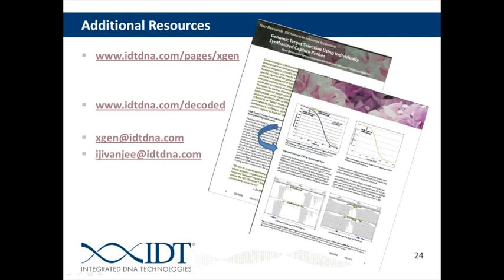Okay, we can definitely help enrich for specific sequences in plants and specifically in cereals. Cereals generally have a very large genome, and so there would be a lot of benefit in enriching for specific or target sequences within cereal. But I think we would have to look at that on more of a case-by-case basis to see exactly what they wanted to enrich for and exactly what the goals were with their sequencing.